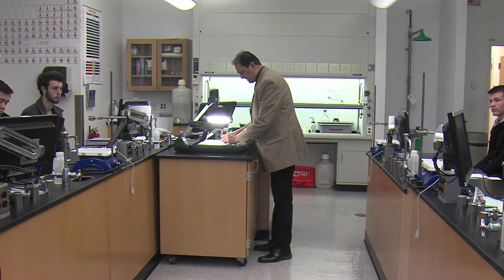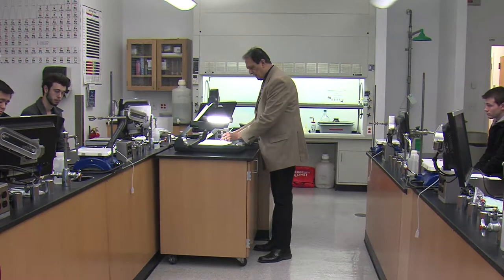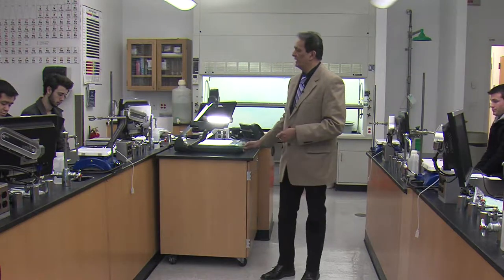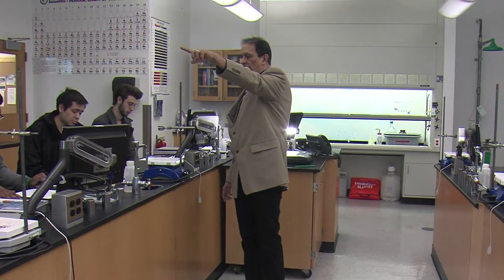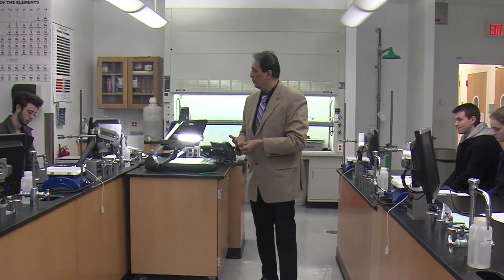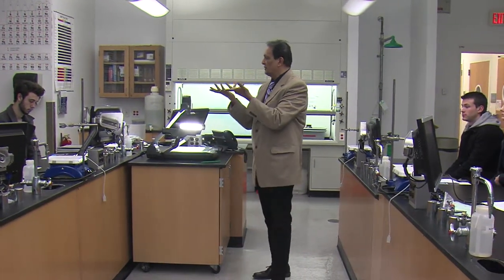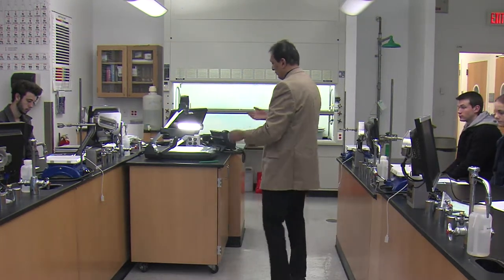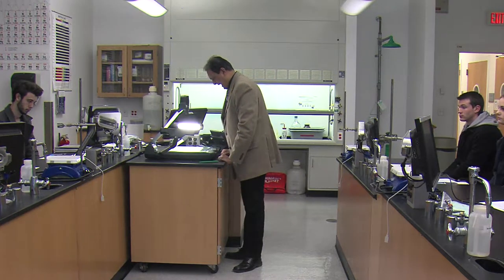We talked about number 17. At the end of the experiment, clean the tabletop with a sponge. Number 18, always wash your hands before leaving the lab. We have a hand washing soap over there. All right, because from here, you're going to go to Wendy's, all right? And now for your convenience, they have opened McDonald's and all that stuff while you go home. And you might eat your sandwich with chemical-laced hands, all right? You don't want to do that. So wash your hands before you leave so that you can enjoy your sandwich at the end of the lab.